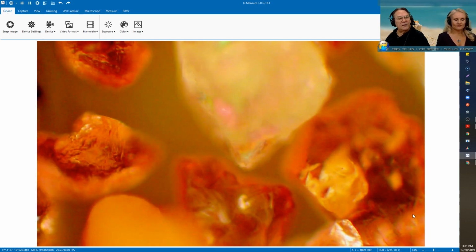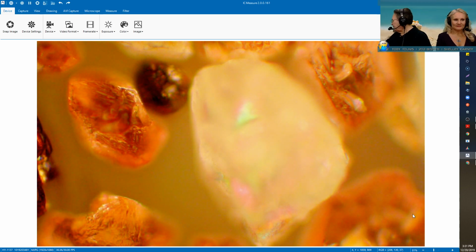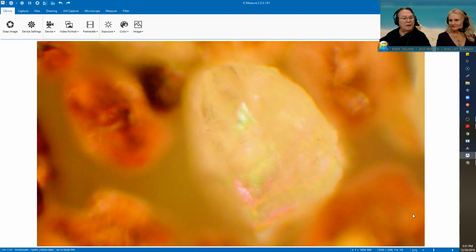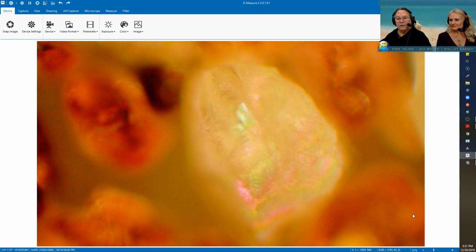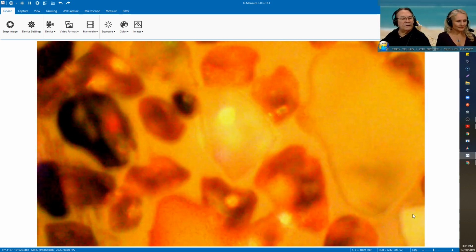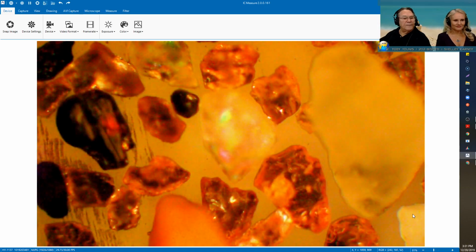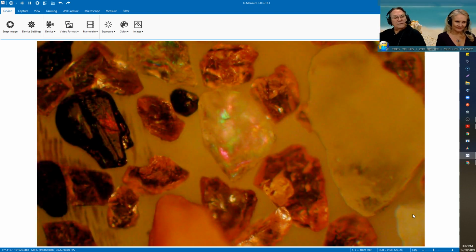Under the polarizing scope, of course, you can always see the color that is reflected back to you from the crystal quartz. And because of our depth of field, these grains, as far as the microscope magnification is concerned, are huge. I think I'm at, oh, I am at 10x. Let's go to 5x so we get a little bit broader look at this stuff. So you can see some of the color that comes out of the crystal quartz. And I'm going to move this back just a little bit.